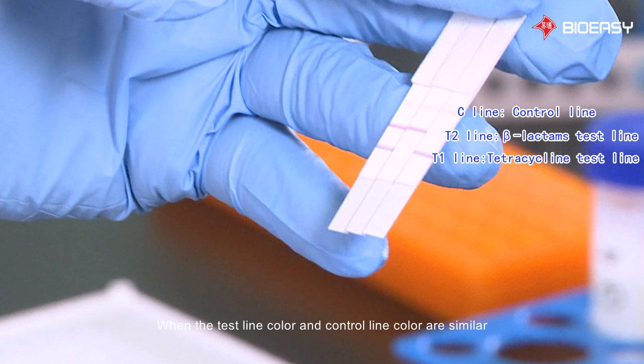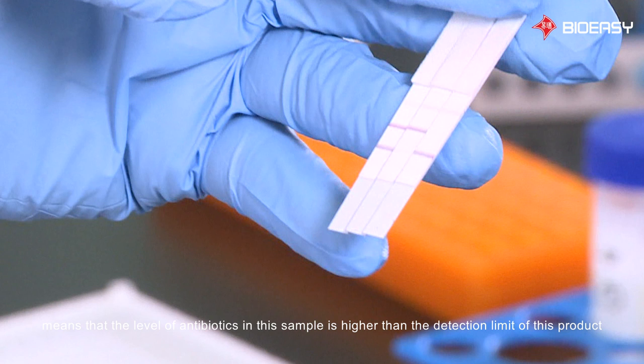When the test line color and control line color are similar, it means that the level of antibiotics in the sample is near the detection limit of this product. When the test line has no color or the color is lighter than the control line, it means that the level of antibiotics in the sample is higher than the detection limit of this product.